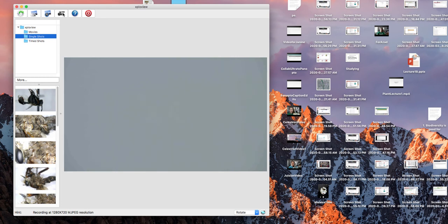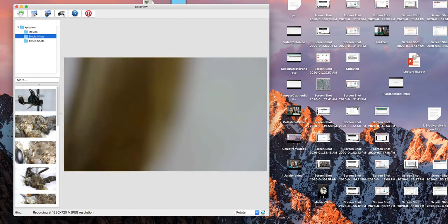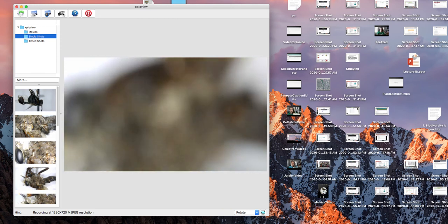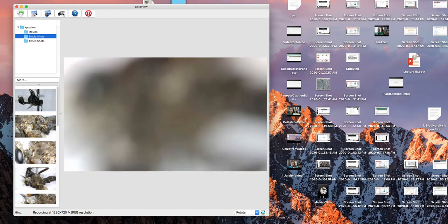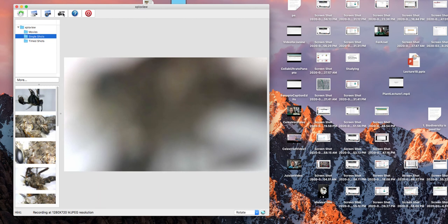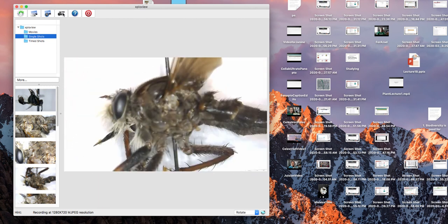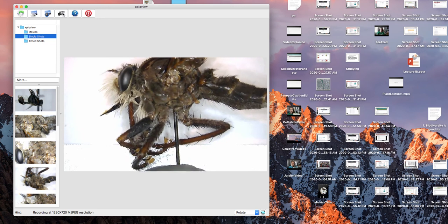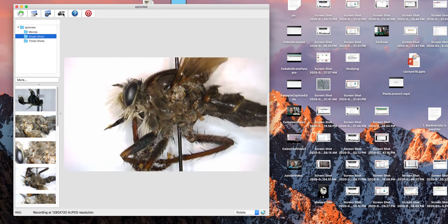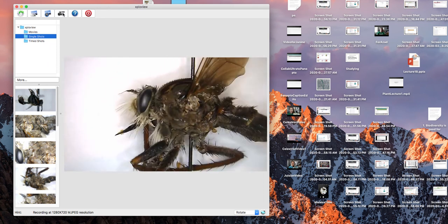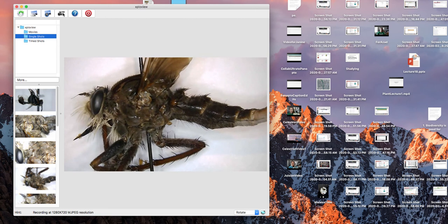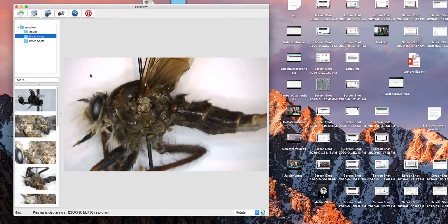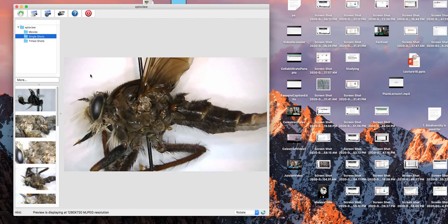Now I'm going to bring out the robber fly again. Now, the unfortunate thing about this microscope is that it's not as easy to take out of its stand as the Celestron was. So I'm not going to do that, but I will show you the highest view you can get and how much of the entire body of this robber fly, which is probably around two and a half centimeters, you can get into view. So that is about the entirety of the insect that I can actually view. Here I am playing with the focus, and I'm at the very top of that stage.